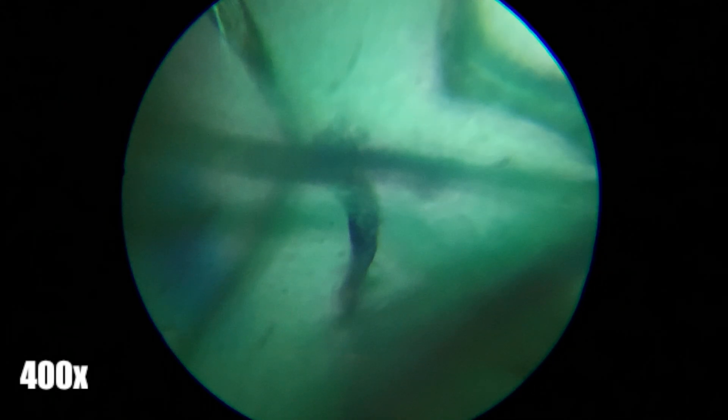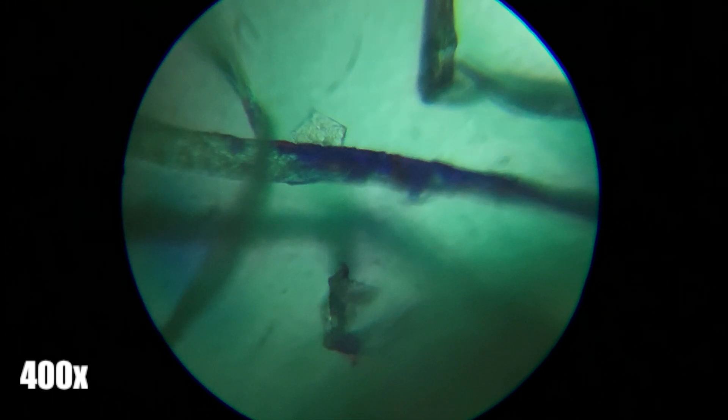The most I could magnify this sample of my shirt was 400x magnification, because the sample wouldn't be flat enough to see anything at the 1000x magnification range.